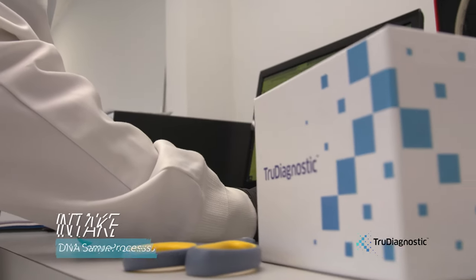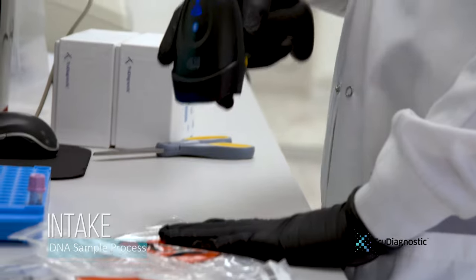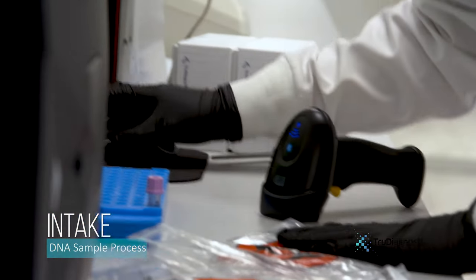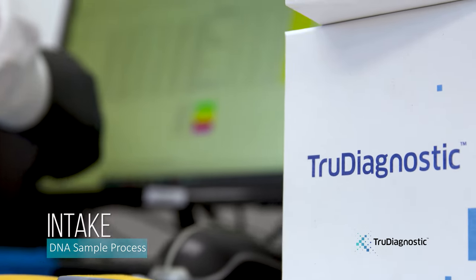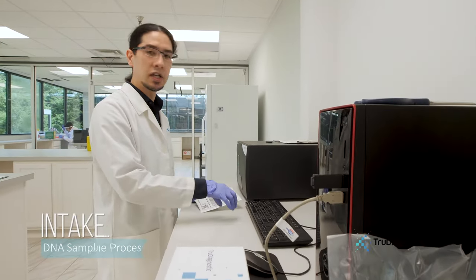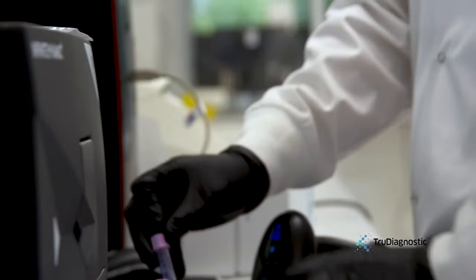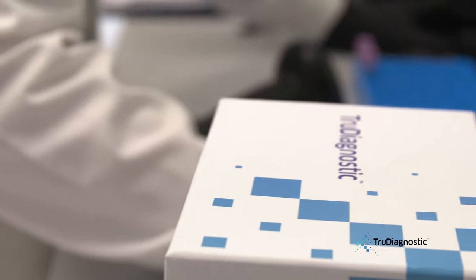The sample process starts here in intake where each sample is received, and then we scan each sample into our proprietary LIMS system. This proprietary LIMS system, developed in-house, will de-identify each sample and give each individual a unique barcode. We not only process TrueDiagnostic samples, we also process various research samples as well.